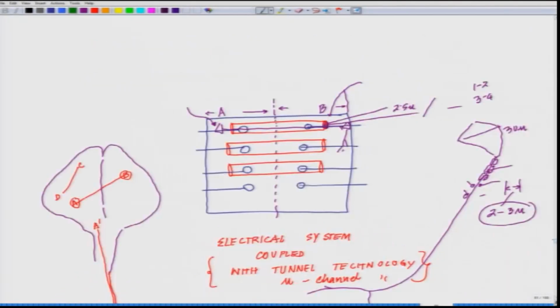Now, following up on another aspect of the last class, when we talked about the microchannel technology coupled with microelectrode arrays, today I will request you to upload the particular paper which I discussed in the previous class. You will observe something interesting: in a 2.5 micron channel, 4 different populations of electrical activity emerged.